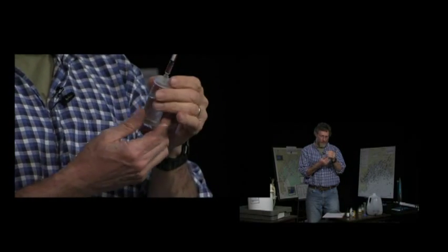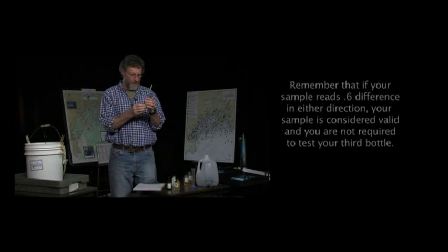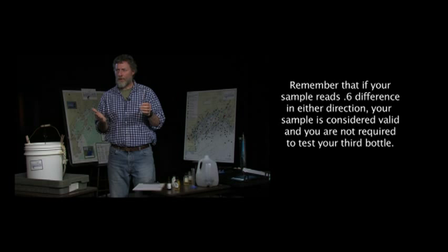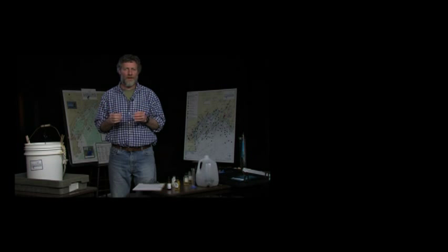And so we'll check the reading on here, and this one is 7.8. The first sample that we did was 7.6, this one's 7.8. It's certainly well within the 0.6 margin. 0.2 is kind of normal for people when they're doing the testing. They often have their first and second samples within 0.2. That's pretty average.